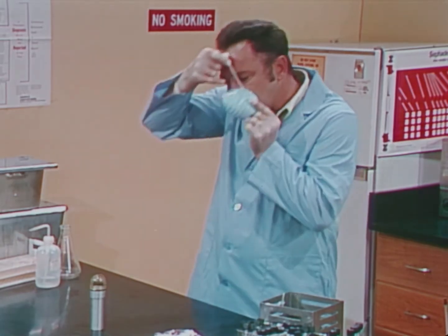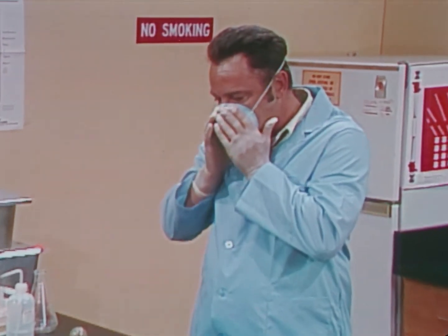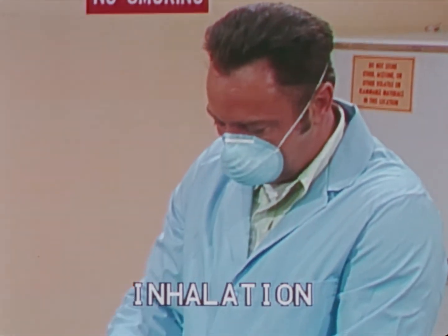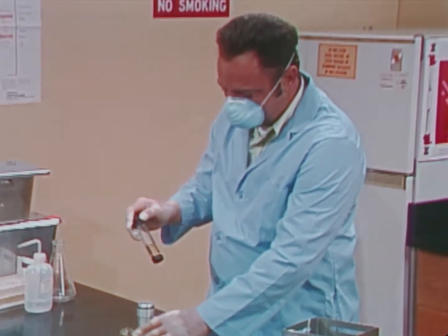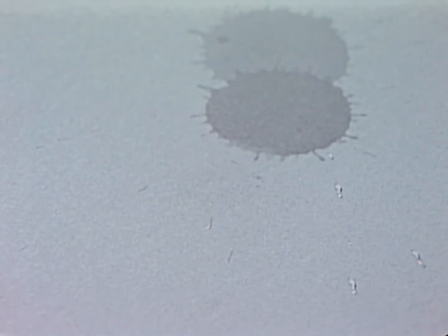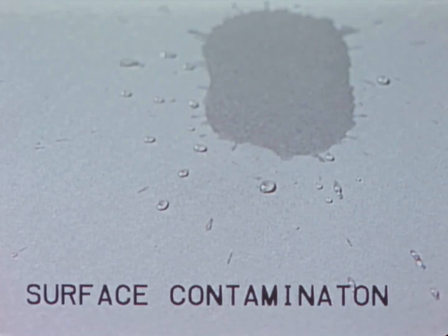The inhalation or airborne route occurs in diseases like tuberculosis. Such diseases are spread by inhalation of bacilli contained within the nuclei. Each droplet nucleus is less than 5 microns in size. Tuberculosis and other diseases transmitted primarily by droplet nuclei are less likely to be of concern when only surface contamination occurs.